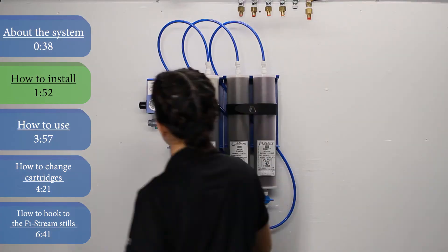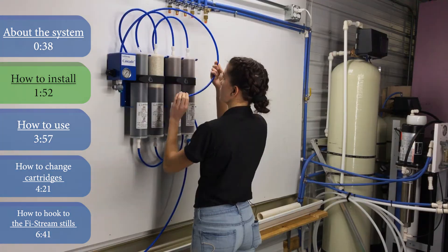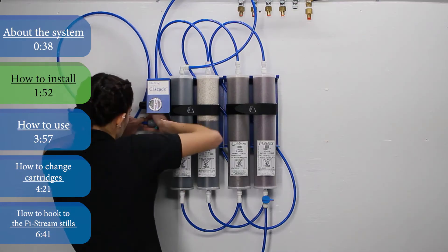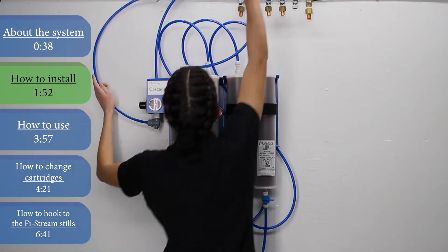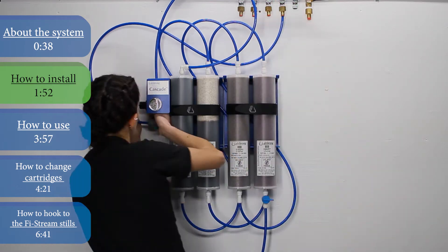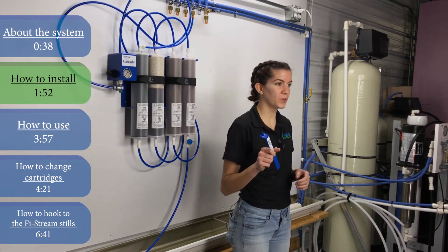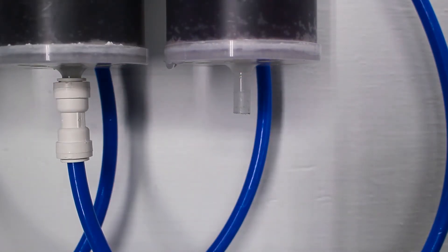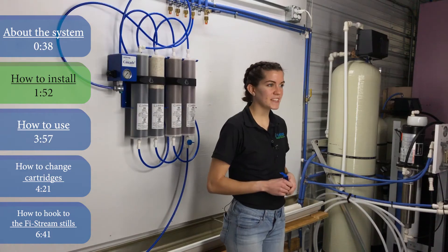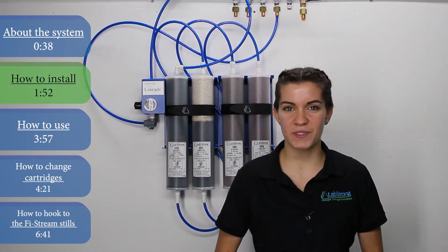Now use the 44-inch tube to connect the pressure regulator housing to the top of the first cartridge on the left-hand side. Ensure the connection is tight, once again listening for the click. The final 52-inch tube will be used to connect the inlet water valve to the water source — just connect the two and make sure the connections are tight. If at any point in this process you make a mistake, just use the included fitting removal tool to remove any fitting and readjust. Be sure that you disconnect from the inlet water source before removing any fittings. Once you've connected the final valve fitting and tube, ensure all connections are secure and then you're ready to use the system.